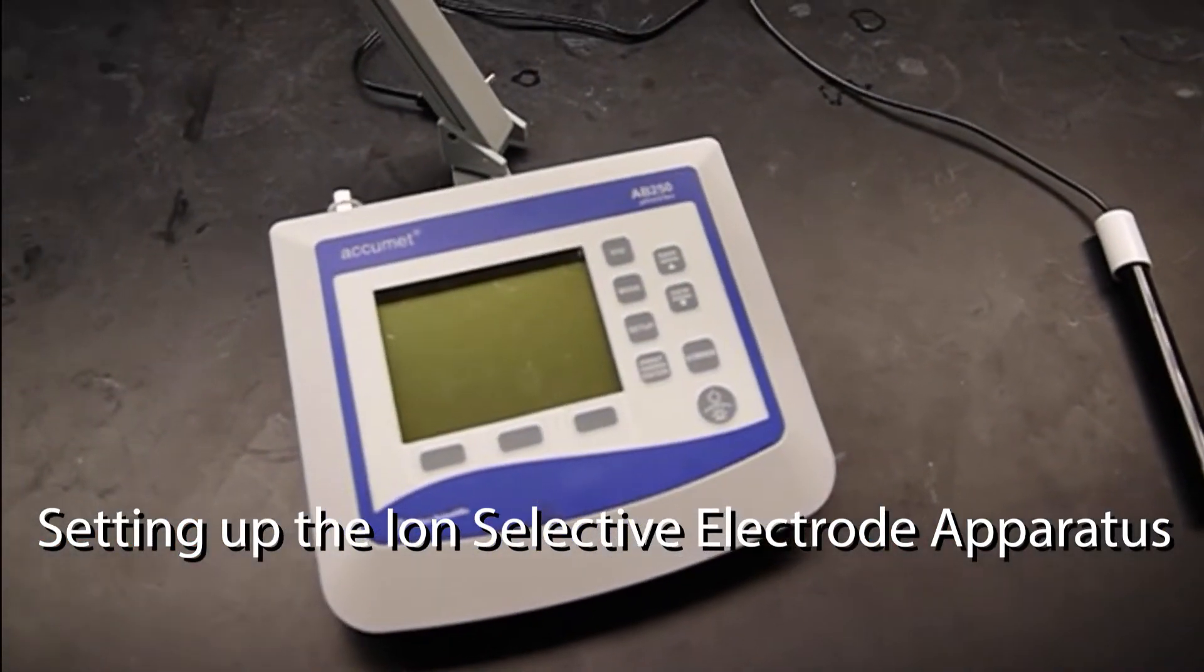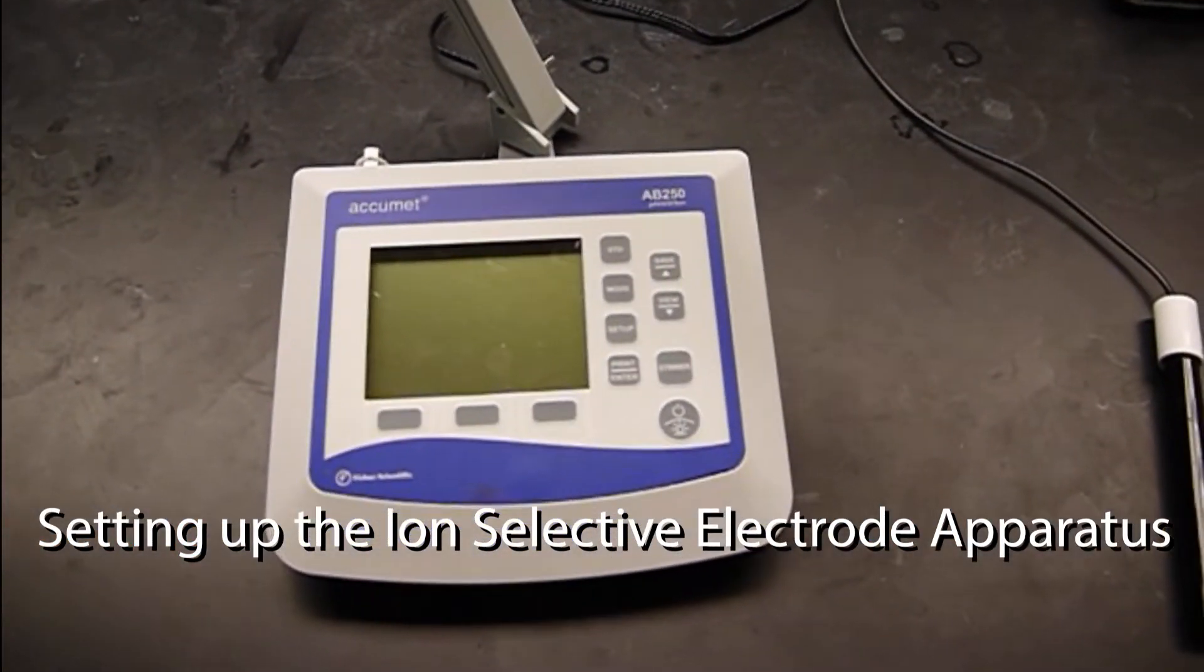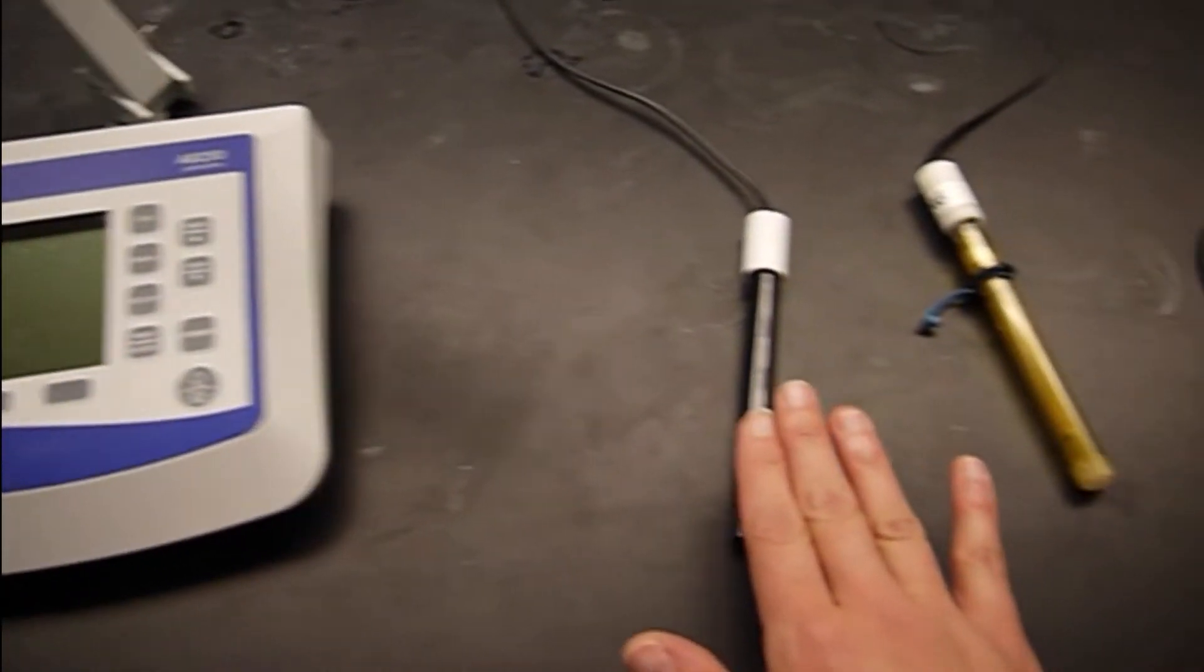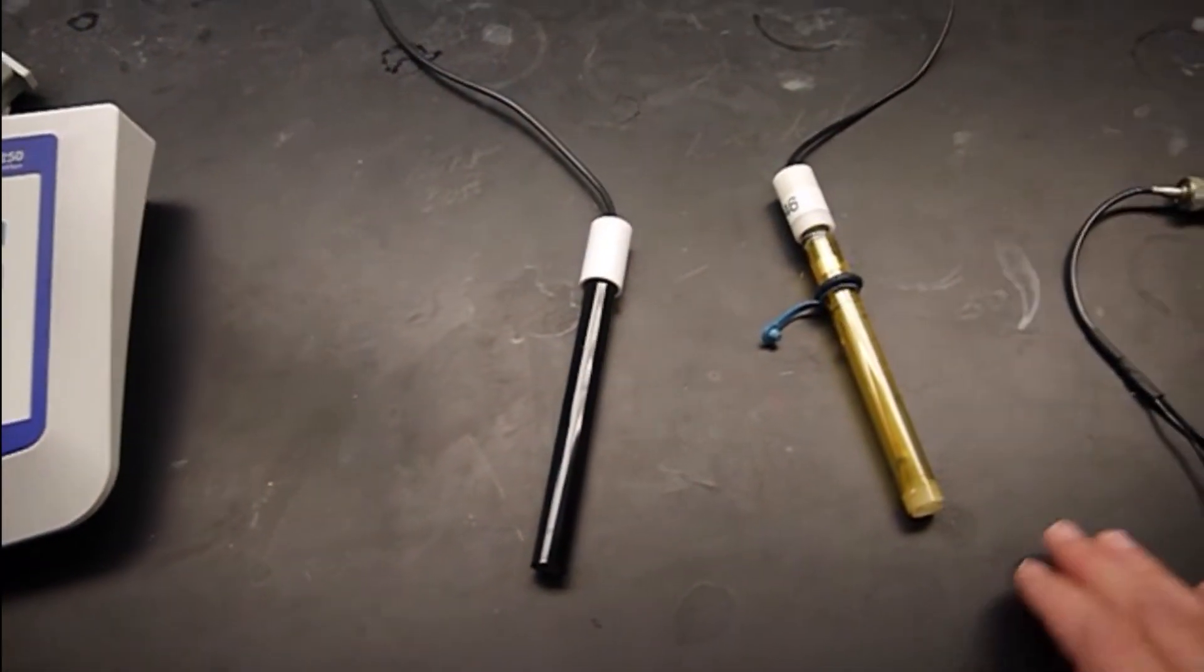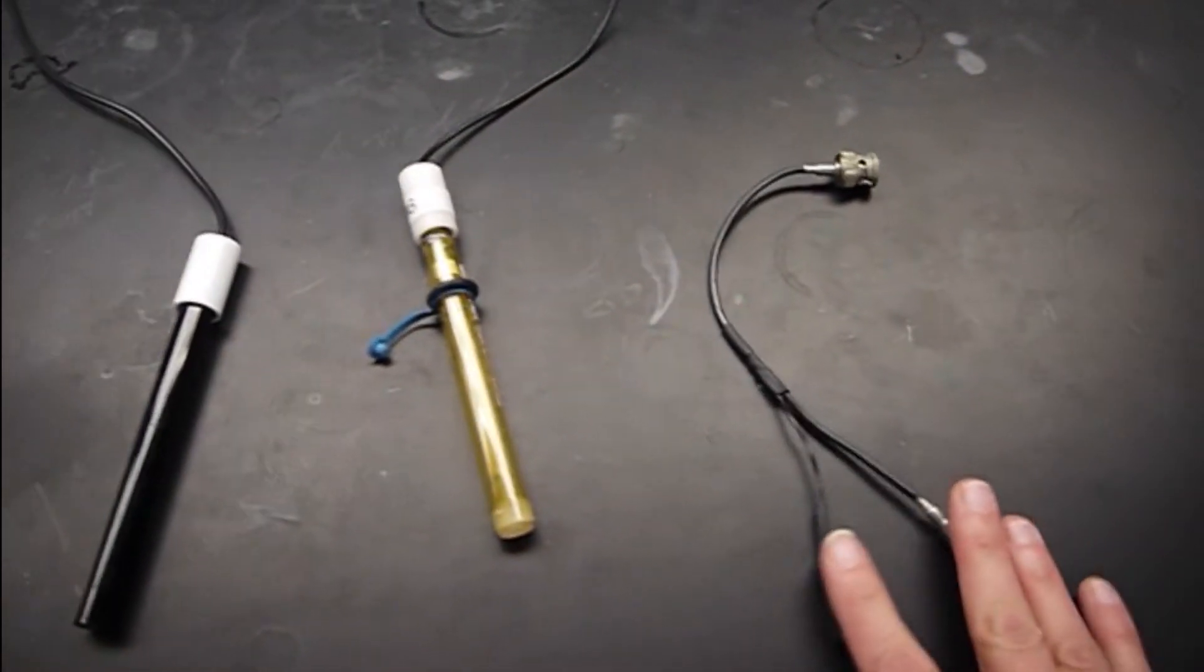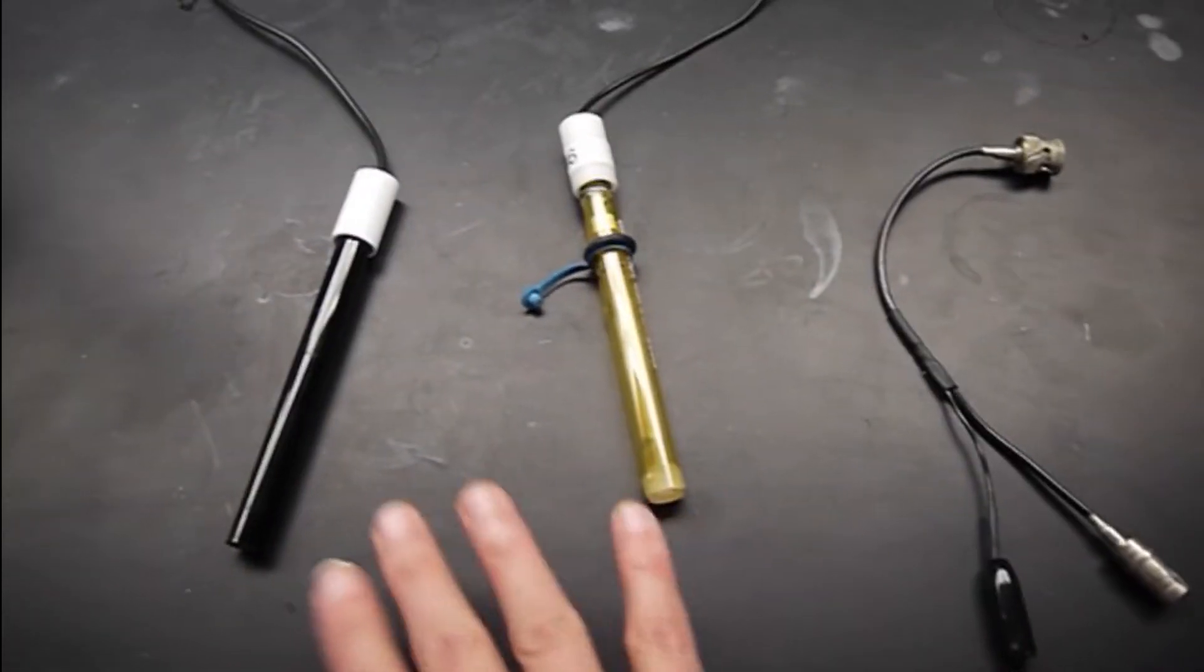Alright, so I've gathered up the meter and supplies for the ion selective electrode lab. We have our meter, selective electrode, the silver silver chloride reference electrode, and the forked adapter that we're going to need to plug these two electrodes into the meter.